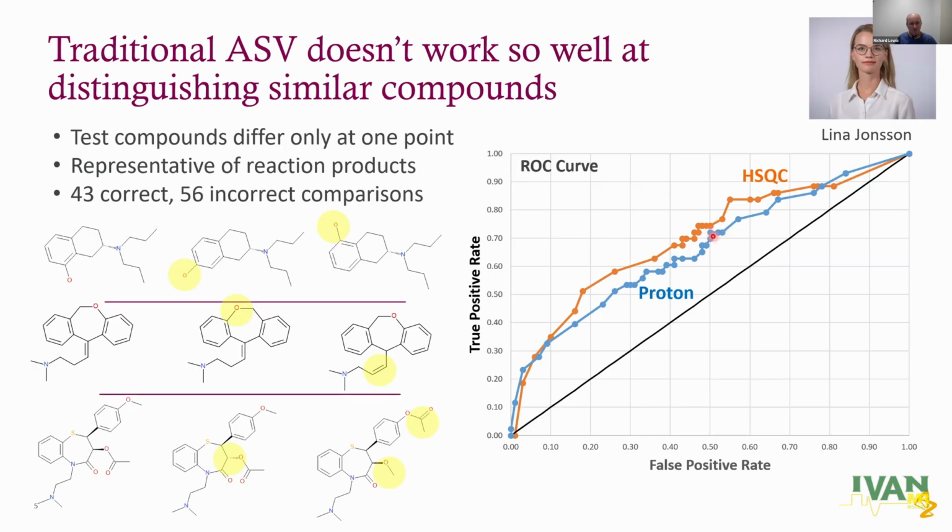So we're getting some discrimination. I should say a random process goes along the diagonal. So for sure we're getting some discrimination, but it's not really good enough to have a viable system, to be honest. But there's some good news coming, and that is to look at the differences in scores between the candidate compounds rather than the absolute scores themselves. So why might that work?